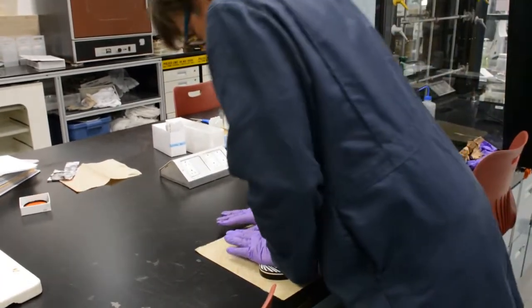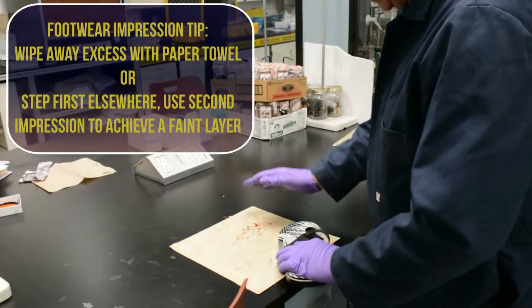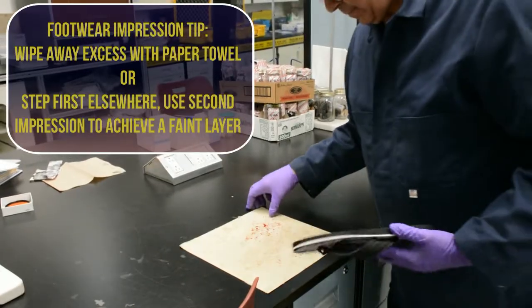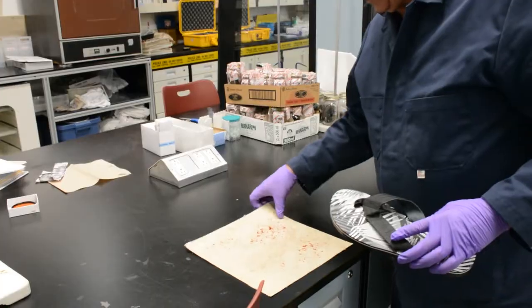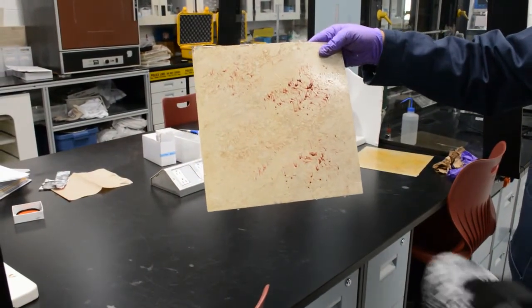And simply walking on that, so we'll get some tread there. Give it the secondary one here next to it. Okay. There are 3 impressions on there. So you can see each of them has a different volume of blood on there.